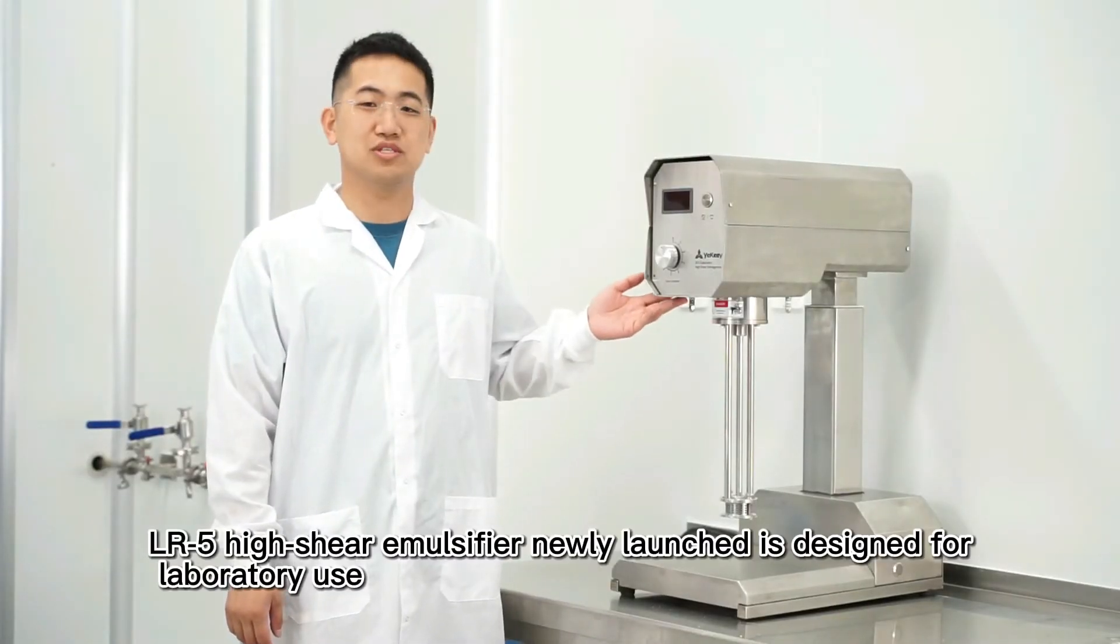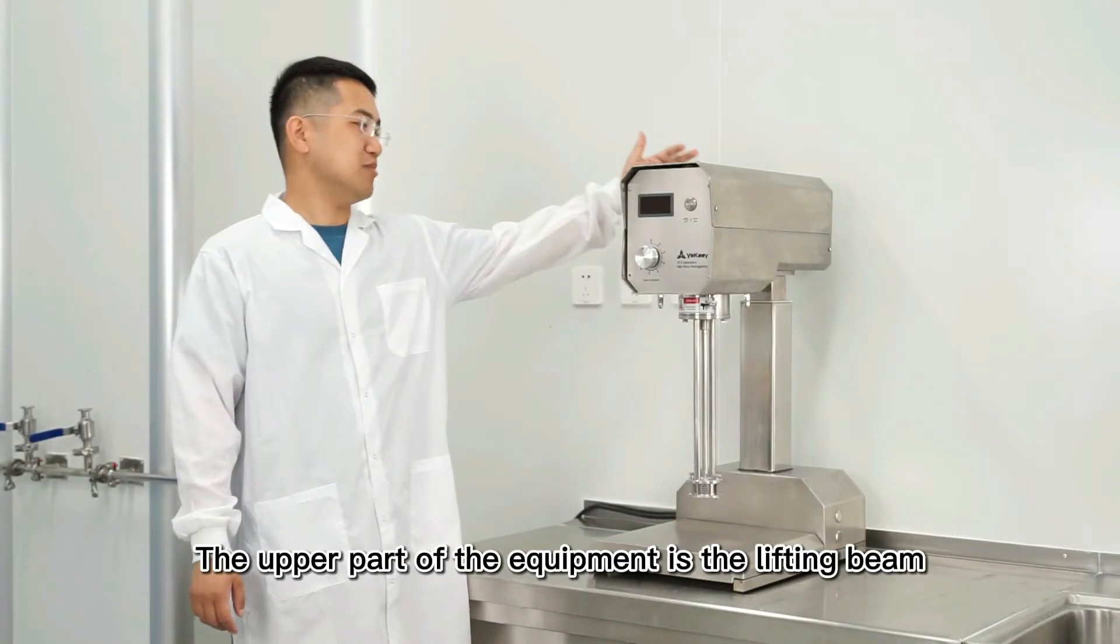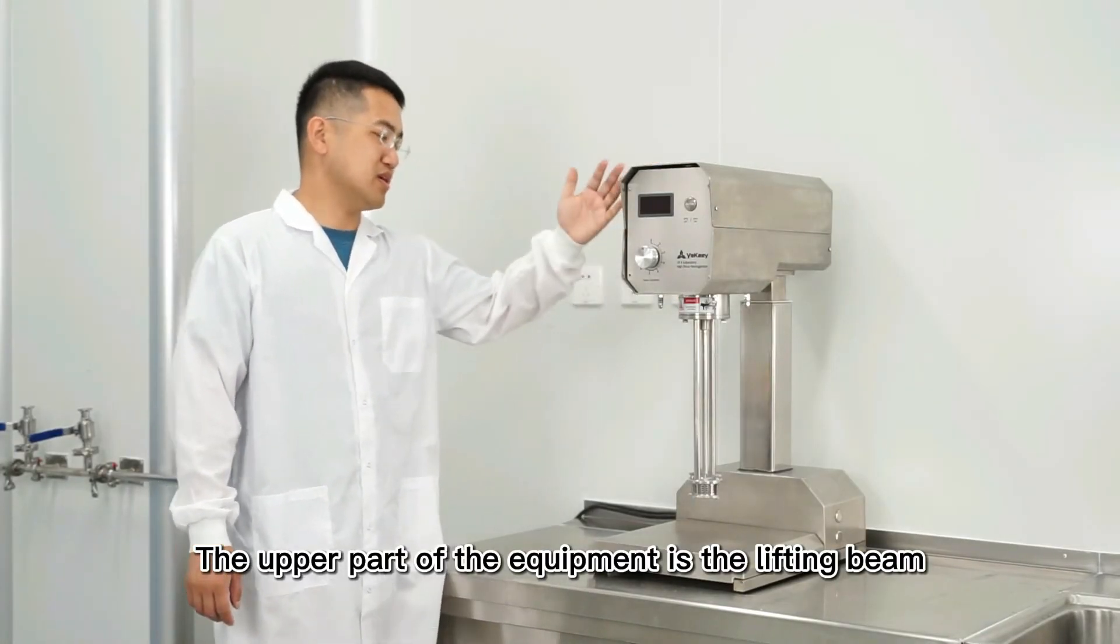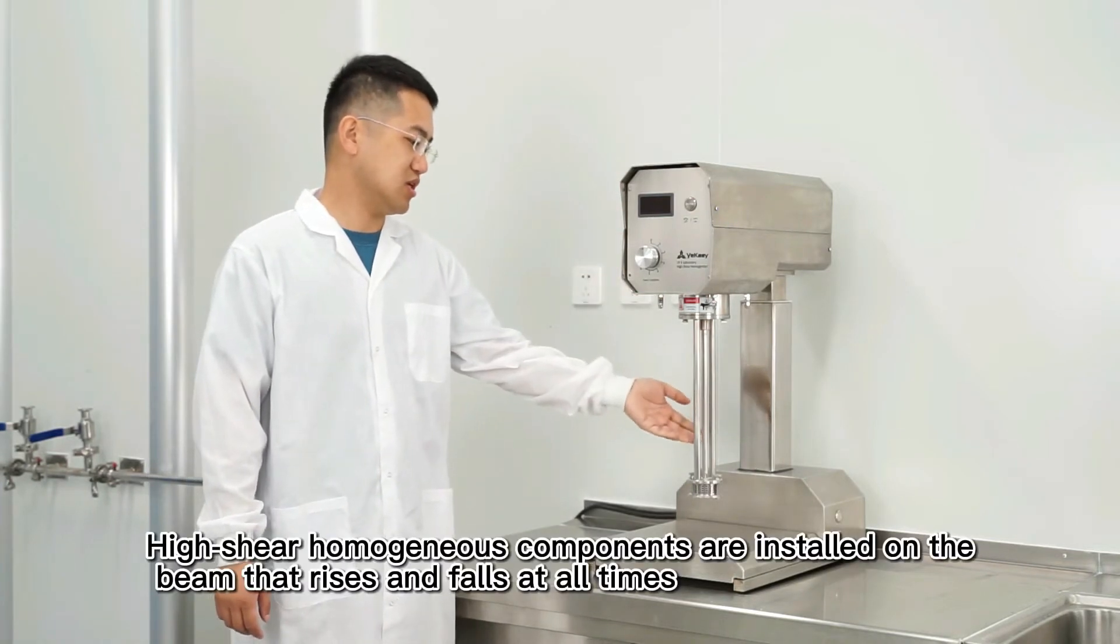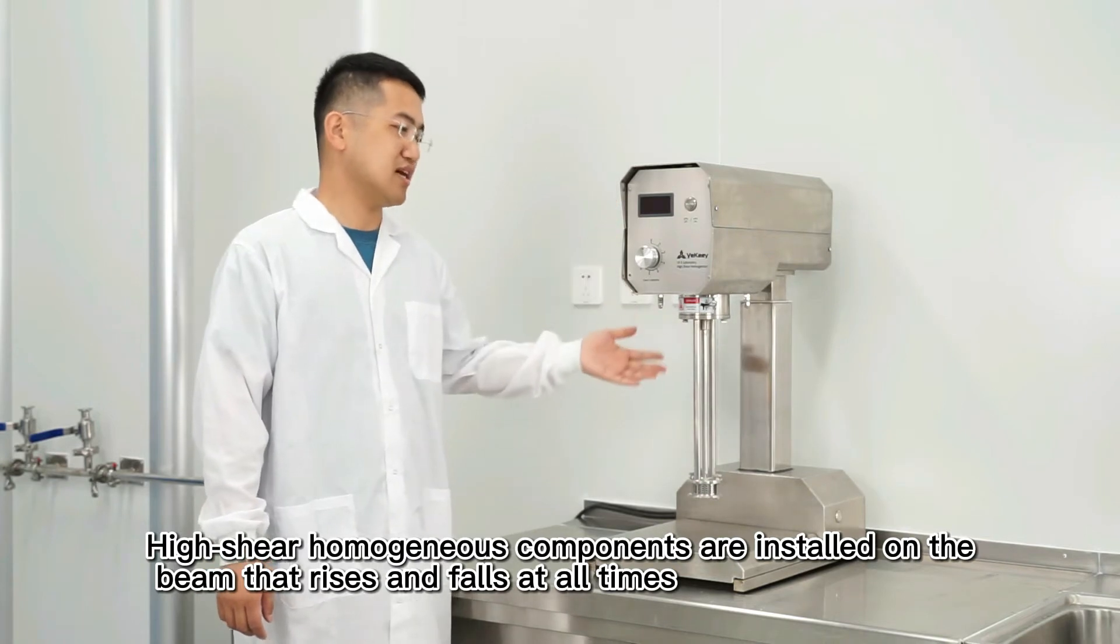The LR-5 high-shear emulsifier, newly launched, is designed for laboratory use. The upper part of the equipment is the lifting beam. High-shear homogeneous components are installed on the beam that rises and falls at all times.